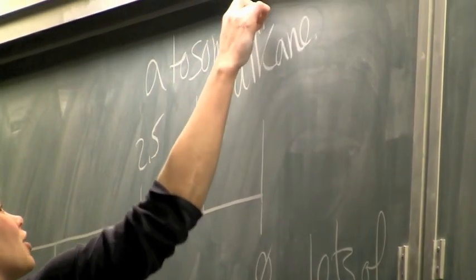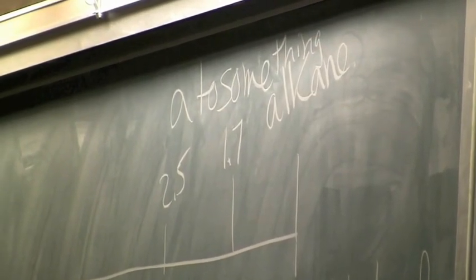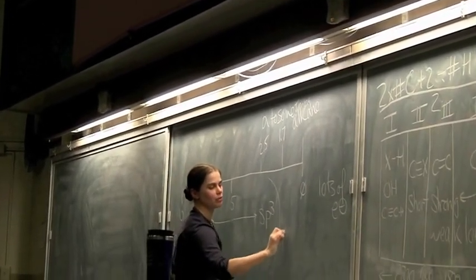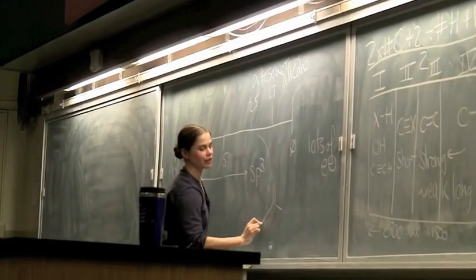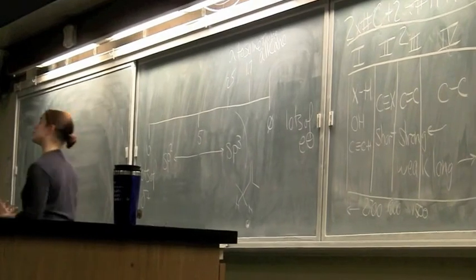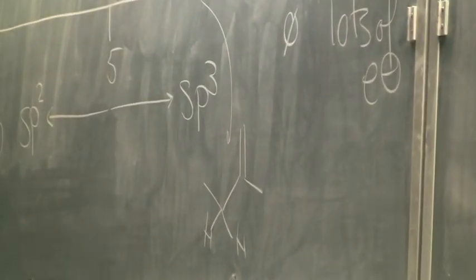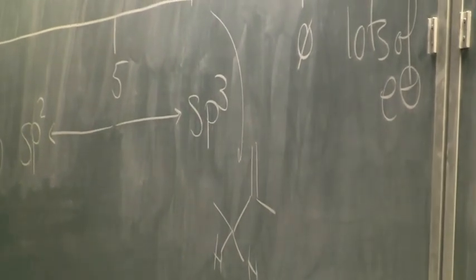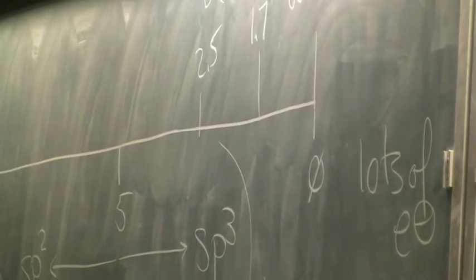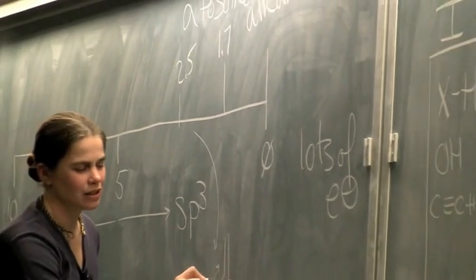But we don't really necessarily know what it is. So that alpha to something interesting range is something that's next to a pi bond. So we've got some sort of pi bond, and we're looking at the hydrogens not on the same carbon, but the ones next door. They're sp3 hybridized, they're not part of that pi system themselves, but that pi system is pulling on them just a little bit. Just a little electron withdrawing, just a little bit of sp2, just a little bit more s character pulling those electrons to the nucleus. And so we just get this little tiny chunk.